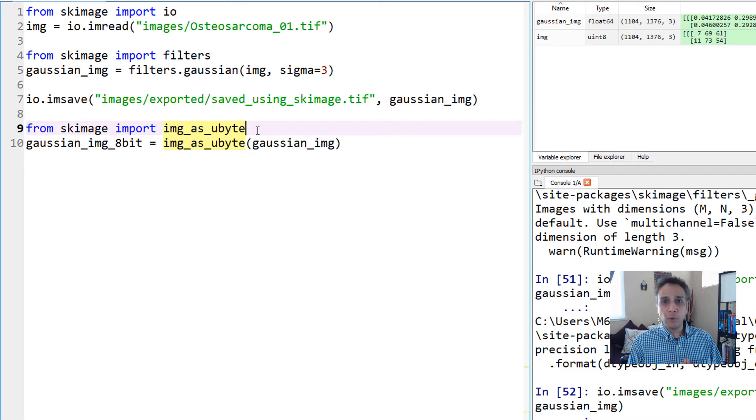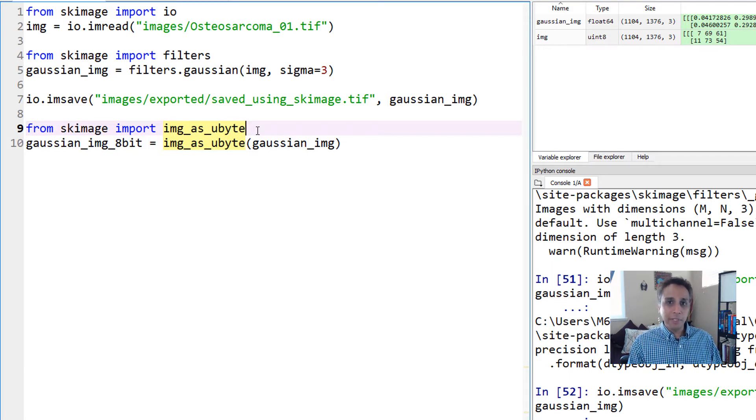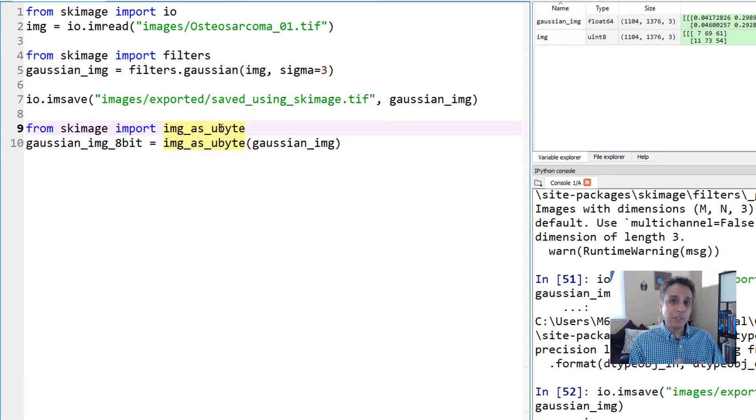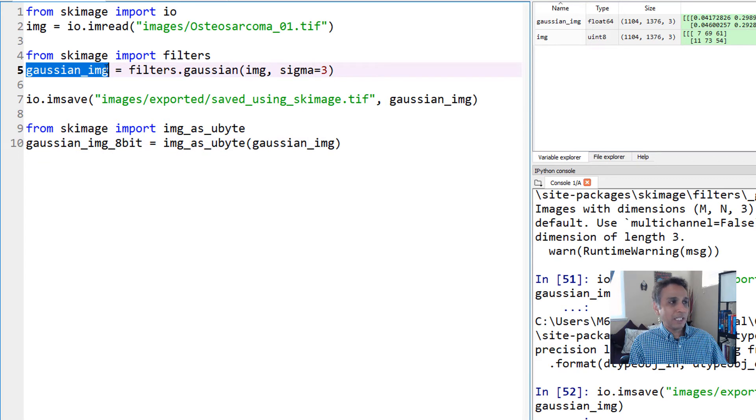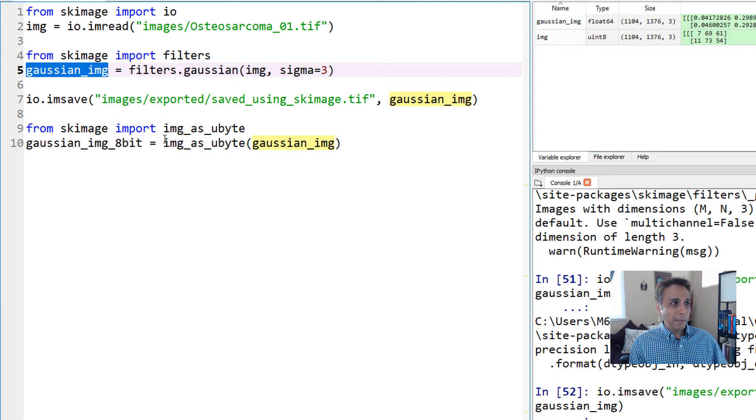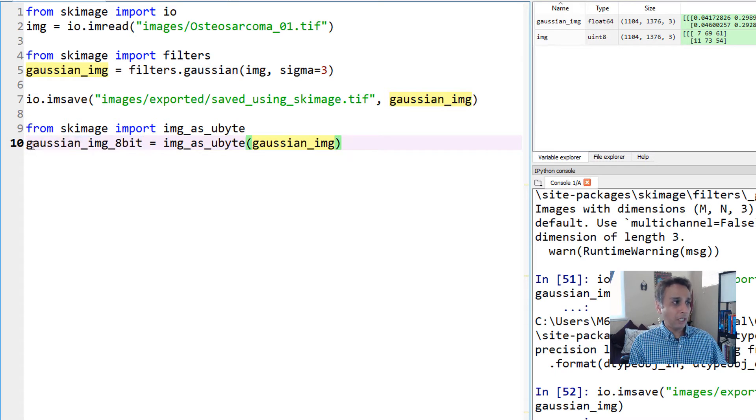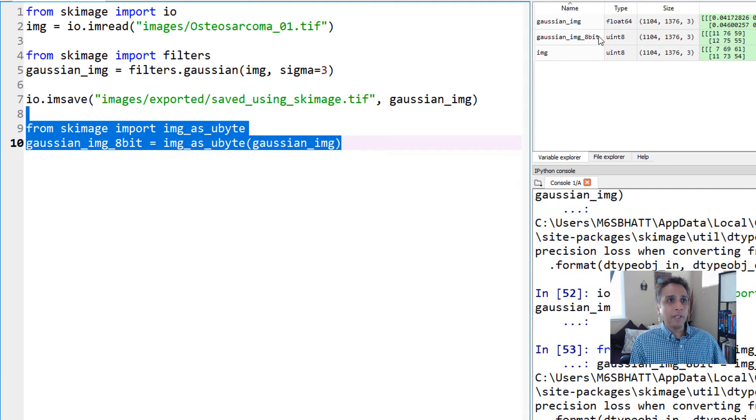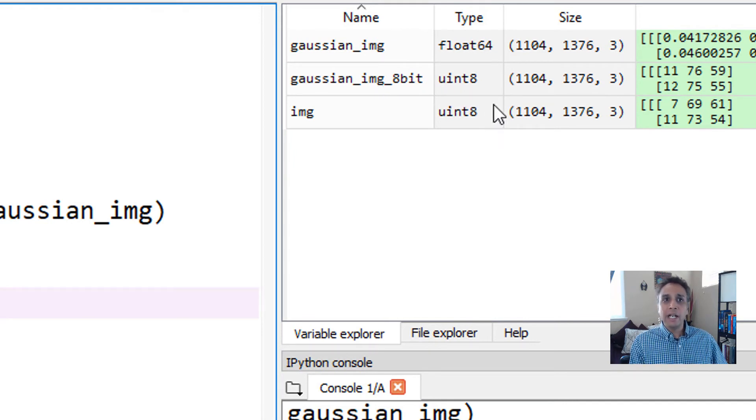Converting 0.04 into an integer the normal way would convert that to 0, in which case all my numbers would be 0 in the image. But by using img_as_ubyte, it converts and scales to the right values between 0 to 255. Let's apply this to our gaussian_img, which is our NumPy array with floating point numbers, and save it into a new array called gaussian_img_8bit.